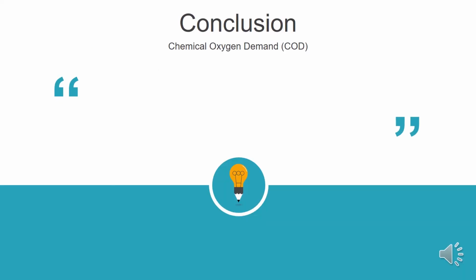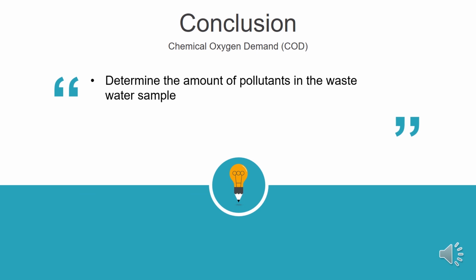The last part is the conclusion. We managed to correctly perform COD analysis and a part of BOD analysis for a set of wastewater samples, which were the lake water of Lembaran and the lake water of Rhydat in our campus. By obtaining the COD and BOD value, we could determine the amount of pollutant in the wastewater sample and the quality of the wastewater sample.